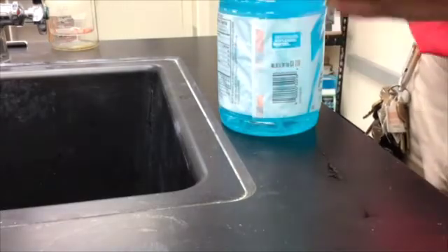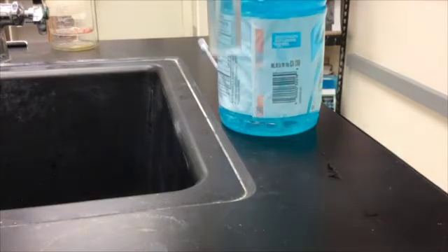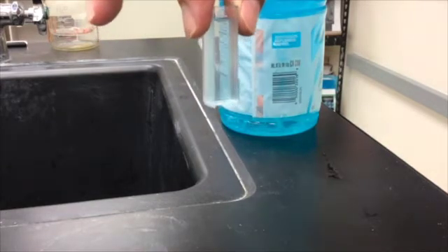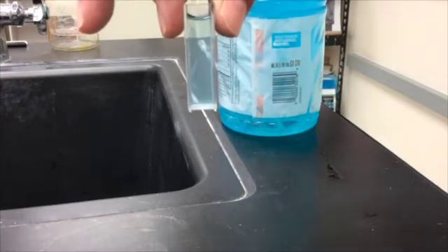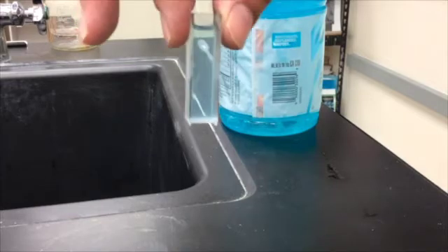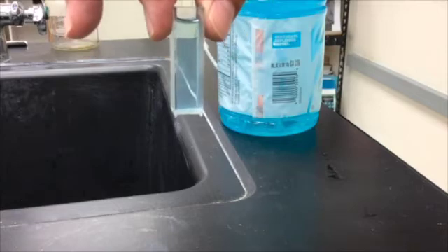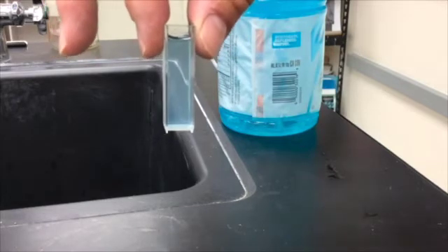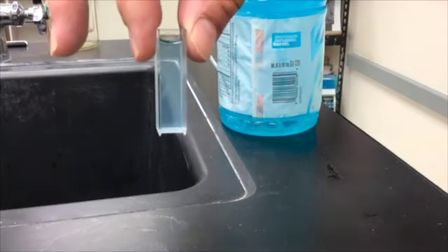And then you just got to make sure that everything is wiped clean, because you don't want any smudges or anything like that in the way. If there are smudges on the clear side of your cuvette, that will absorb more light. You also don't want any bubbles in there, because bubbles will diffract the light as well. So you want to make sure that it is as smudge and bubble free as possible, because those things will affect your absorption. So anyway, now I've got this filled with just my Gatorade.